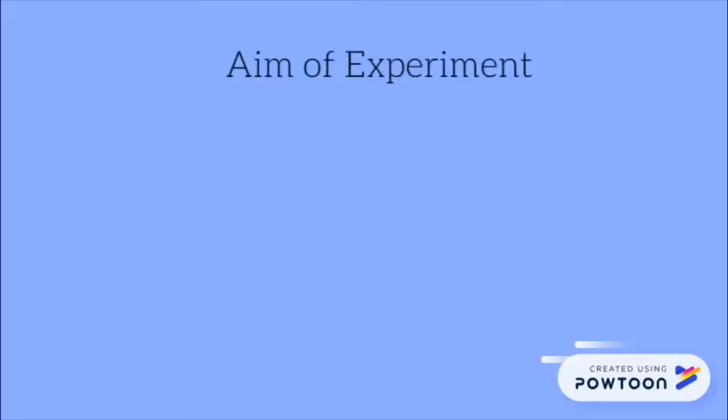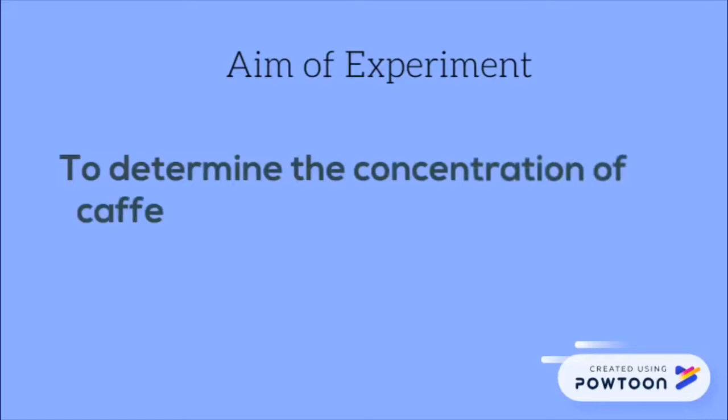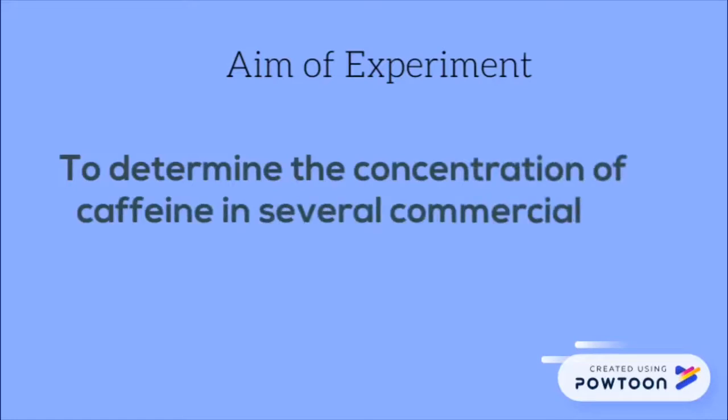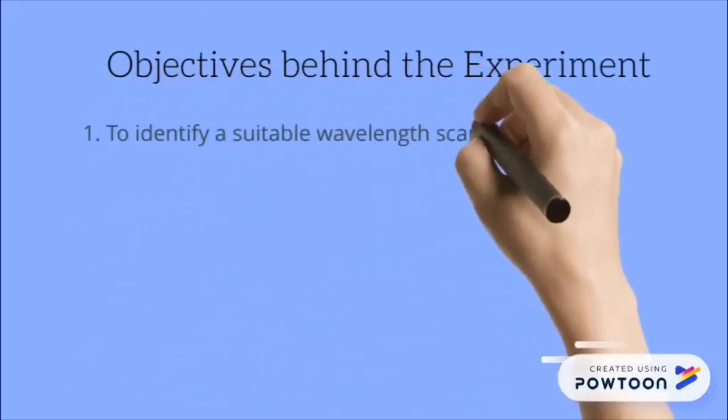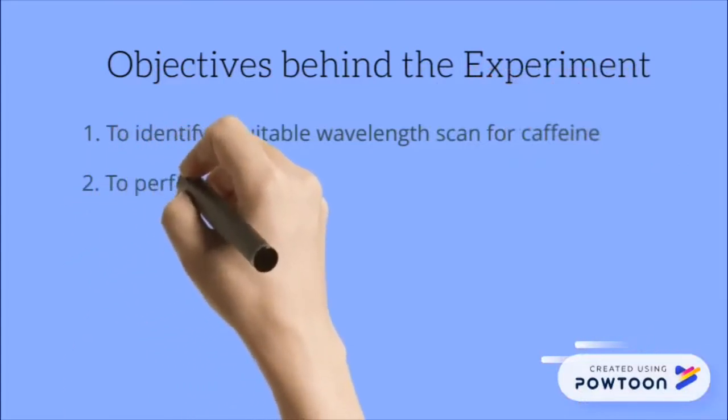The main aim of the experiment is to determine the concentration of caffeine in several commercially available beverages. There are 4 objectives behind the experiment, which are stated as below.